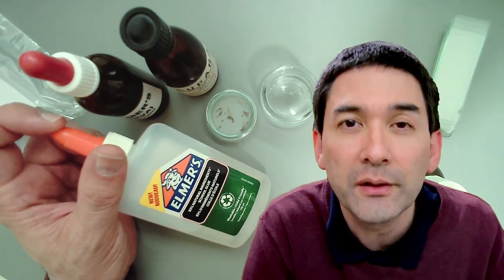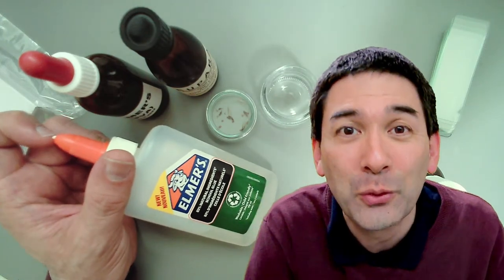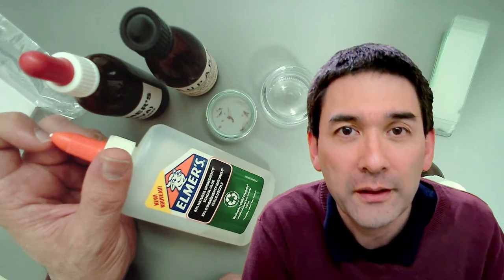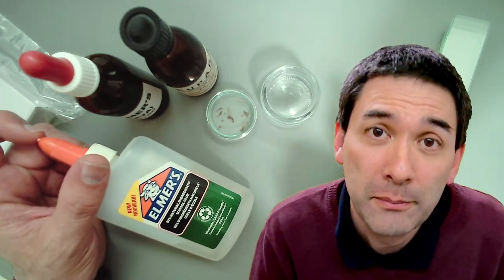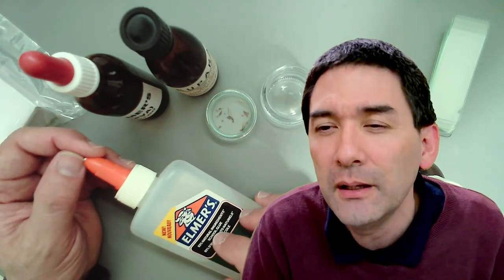And I've also heard that some people are actually doing that also with slides that do not contain water-based solvent but organic solvent. So some people have actually also been trying to dissolve the mounting medium of slides which were based on organic solvent. So they simply put it into alcohol or something like that to redo the slide, which might be necessary sometimes if you have rather rare specimens.